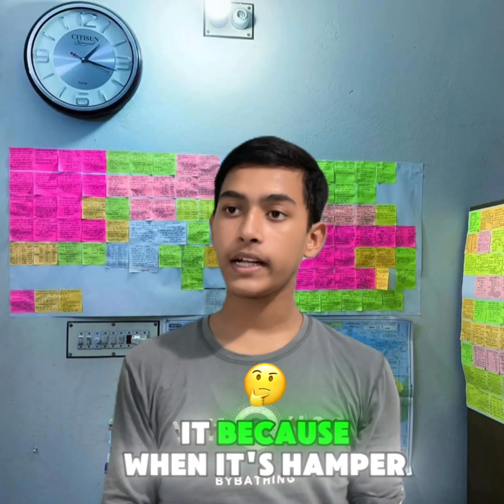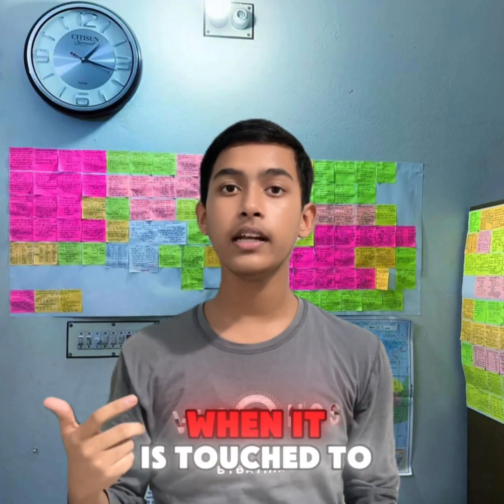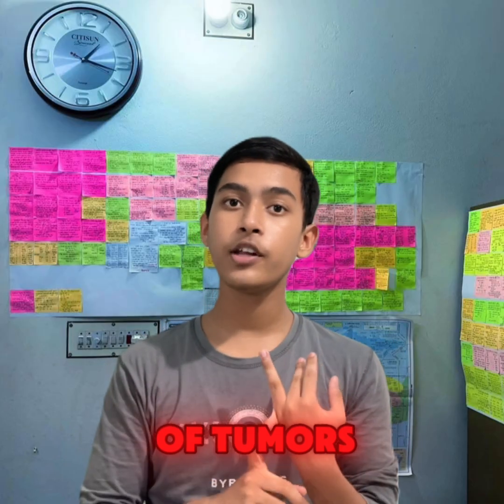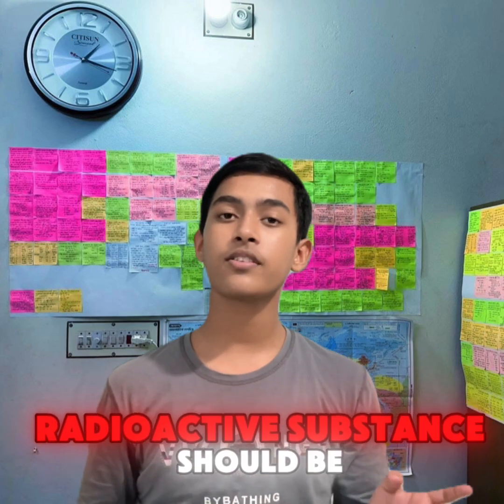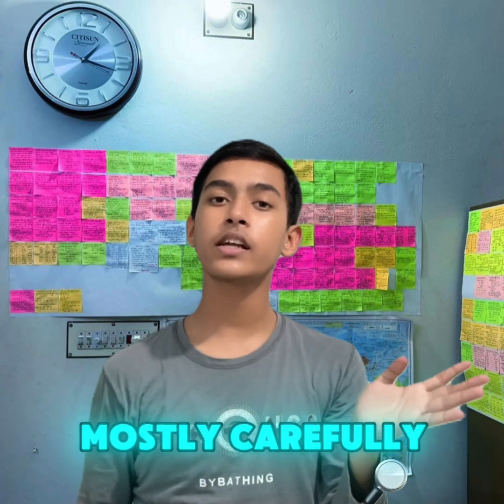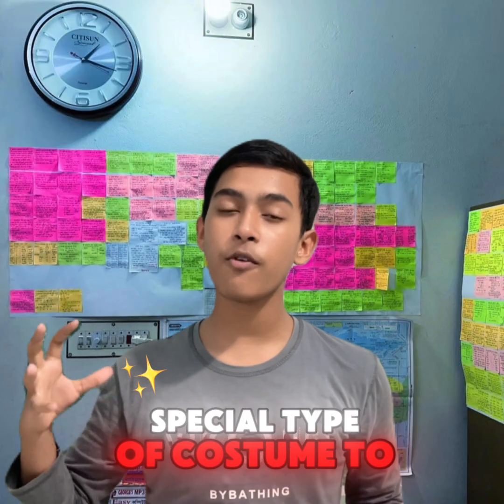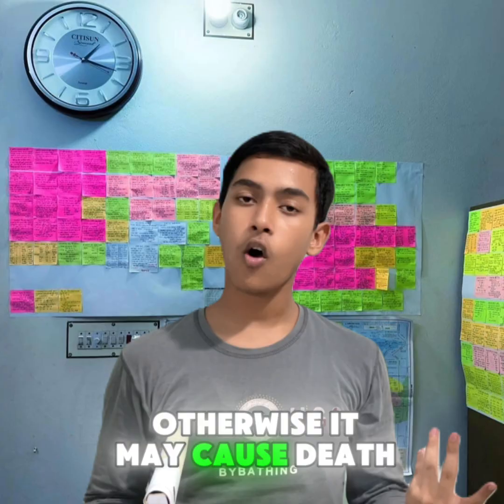When we inhale it or it touches our body, it will produce many types of tumors, many types of cancers, and different health issues. So radioactive substances should be handled very carefully. We have to use a special type of costume to handle them. Otherwise, it may cause death.